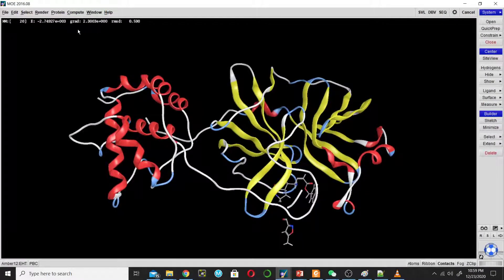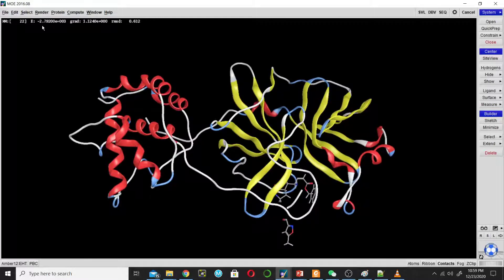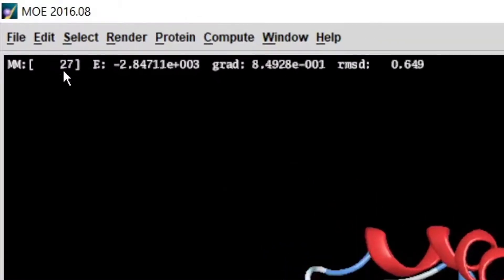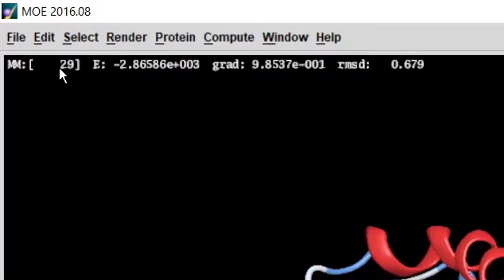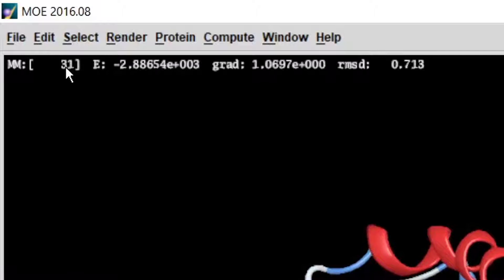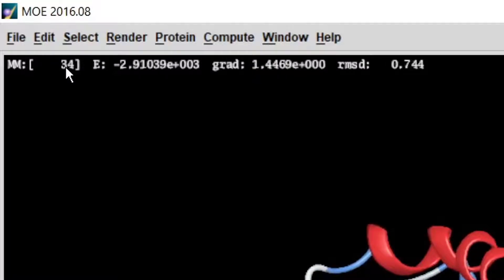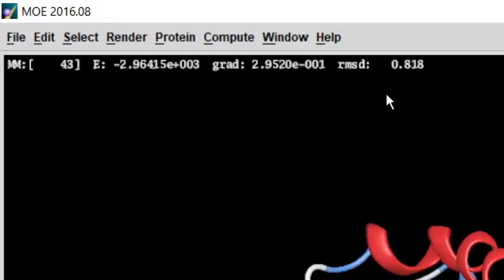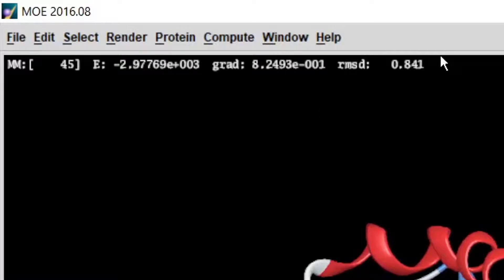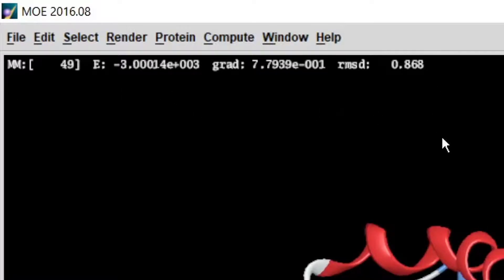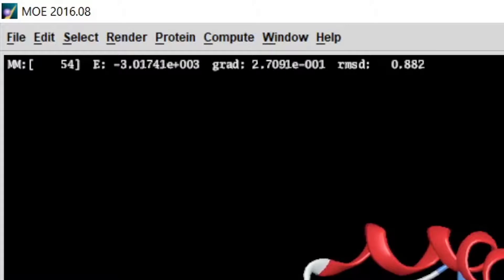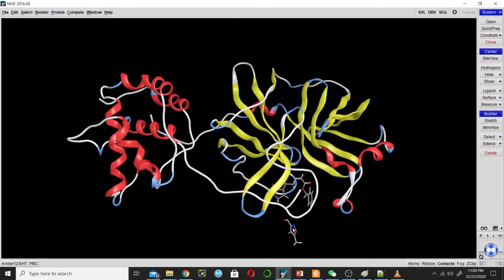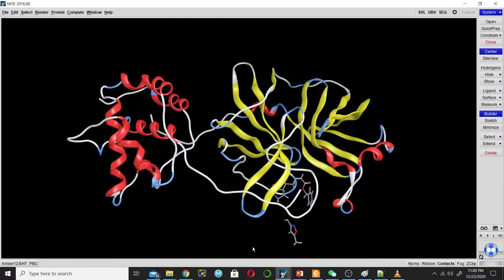Now it's performing the energy minimization in steps: step 29, 30, 31, 33. We have to wait until this text disappears. When this text disappears, it means the energy minimization is completed. Now the energy minimization is completed. Now we will go for step 5, that is the docking.